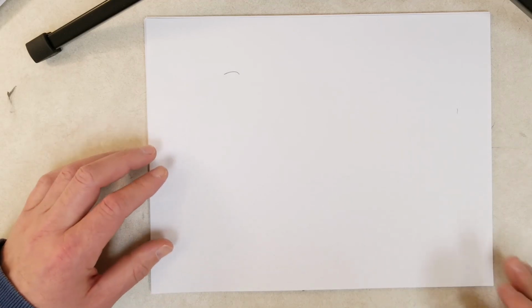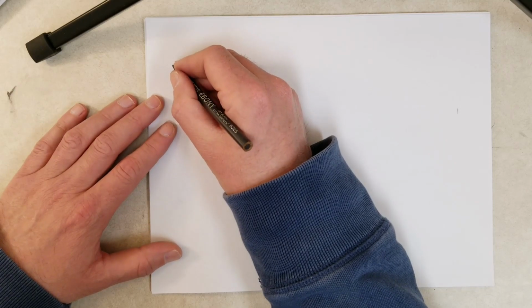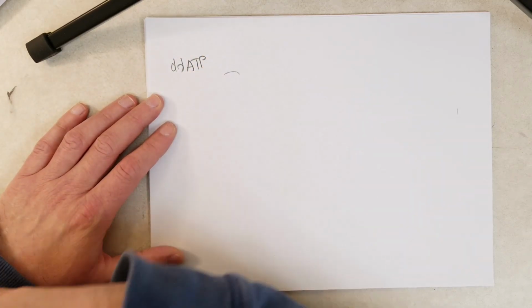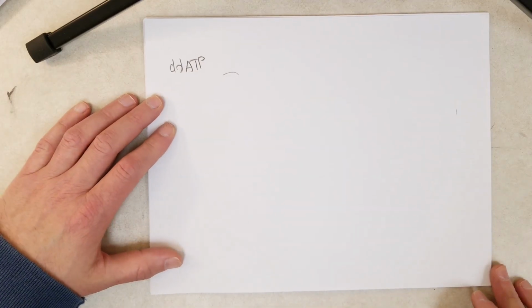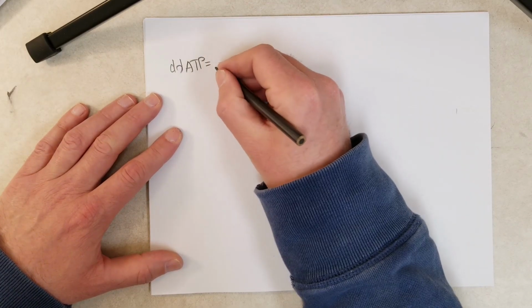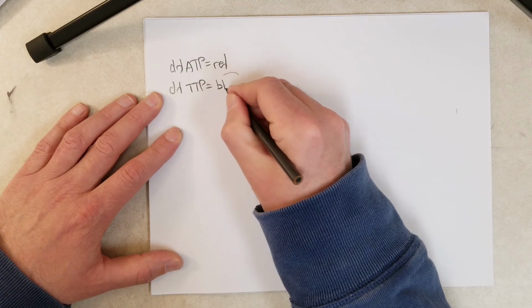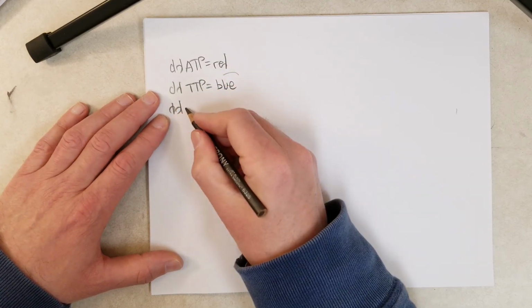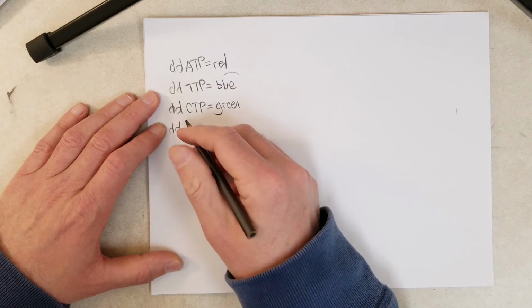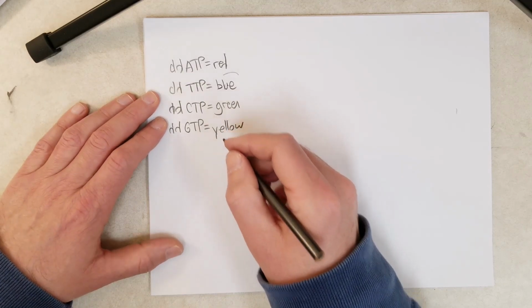Now, a couple more things on Sanger sequencing. So some advances. So that was the classical Sanger sequencing method. And you can take a look in the notes where we talk about how they use radioactive dideoxy nucleotides in order to be able to see the DNA on the gels after gel electrophoresis. But with some advances now, it's possible to add fluorescent molecules to the dideoxy NTPs. So let's say, and the colors, they might be semi-standard. I think each biotechnology company that produces components for these types of experiments might use their own color system.